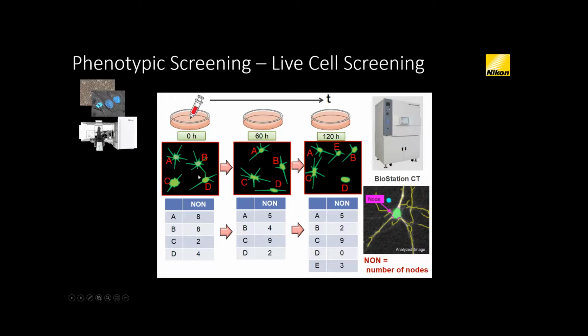The control groups include a healthy group and then a group that's been damaged somehow to represent neurodegeneration, right? And then compounds are added to the injured groups to see which compounds reverse the neurodegeneration, or in other words, lead to more healthy cells by the end of the experiment.